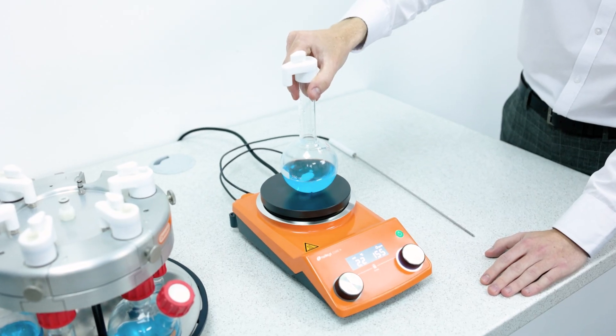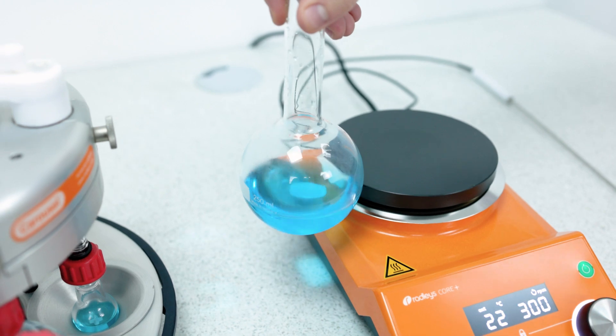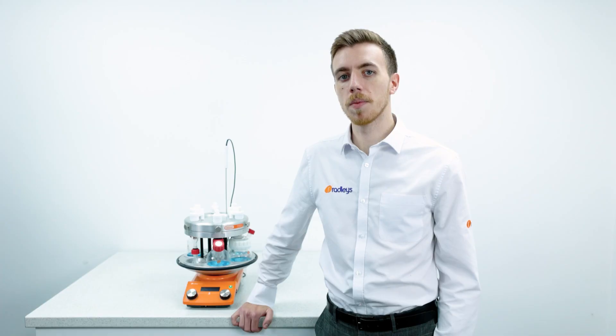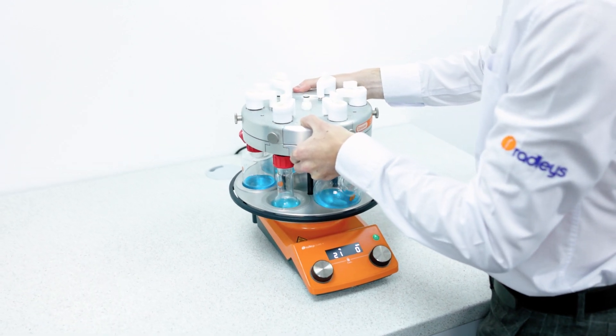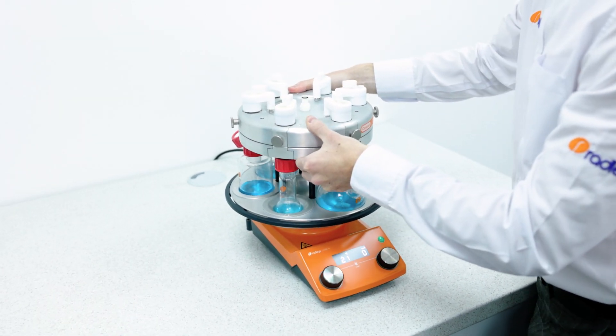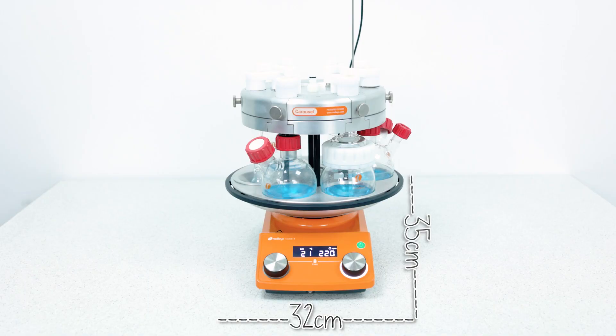The Carousel 6 Plus has a patented design that allows you to utilize a secondary magnetic field to ensure powerful and even stirring at each of the positions. We can then place the Carousel 6 Plus with one set of glassware onto the 135 millimeter hotplate. The space-saving design utilizes only 35 by 32 centimeters of your valuable fume hood space — far less than six traditional setups.